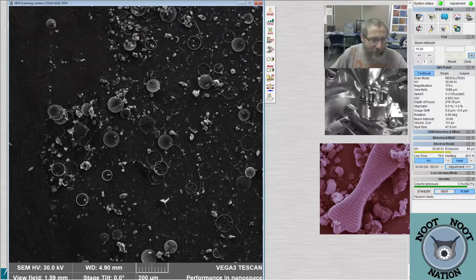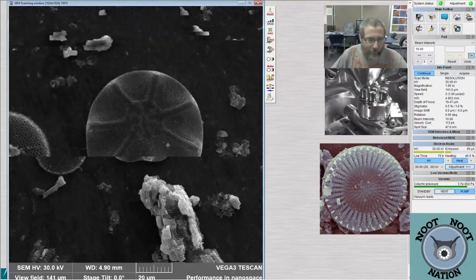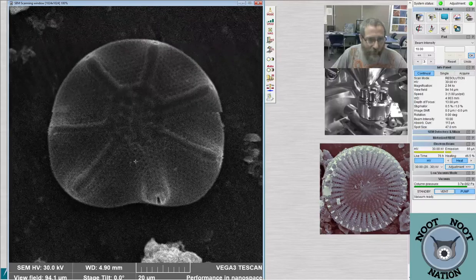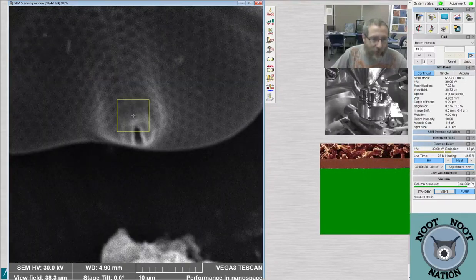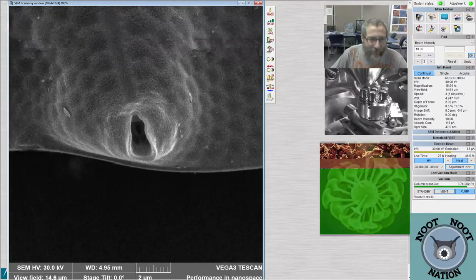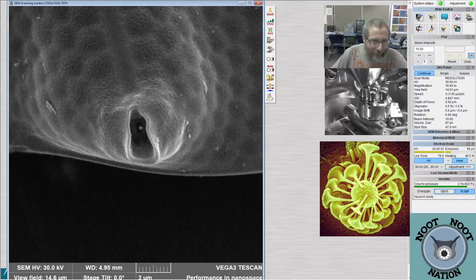They're just controlled slightly differently in the SEM than they are on a typical camera, but they're still the same concepts. A lot of what we're doing is really equivalent to taking pictures. And when we're done, we also have a picture, but it doesn't use any light. So it's just a picture with no light. That's a picture with no light, exactly.